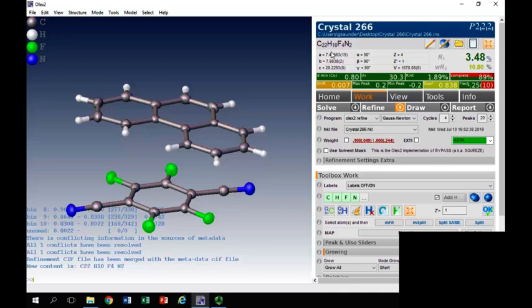It's not 3/4 of a molecule. Okay, so it considers it to be the whole component. And if you've got solvent, of course, that will be part of the molecule as well. Anions and cations related similarly. Right.